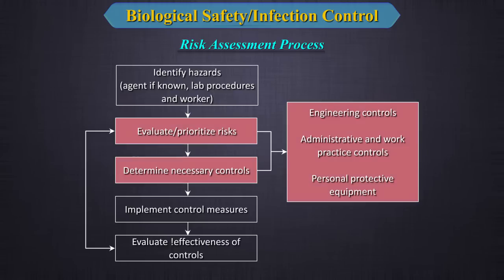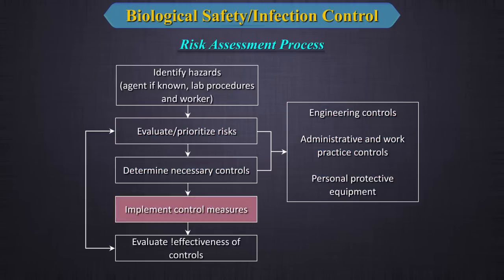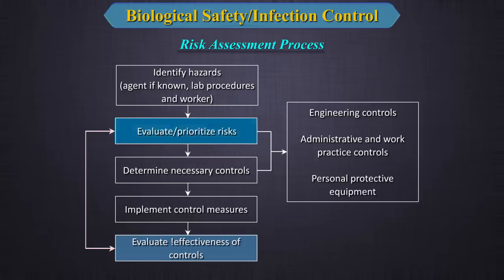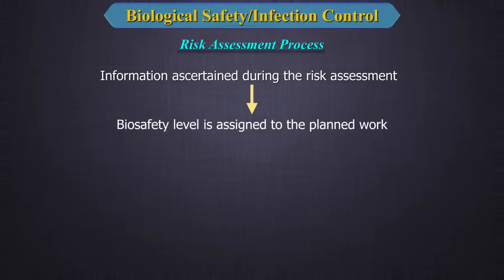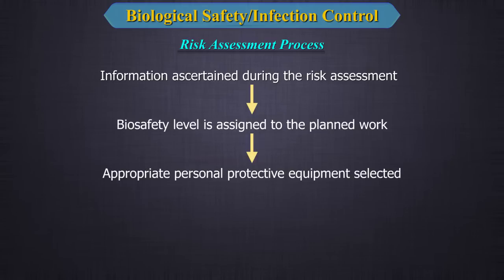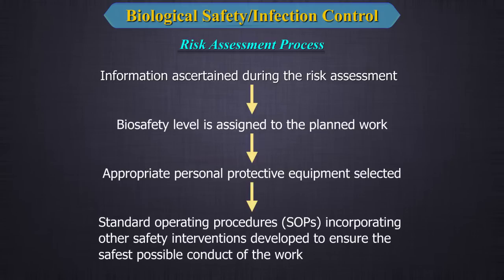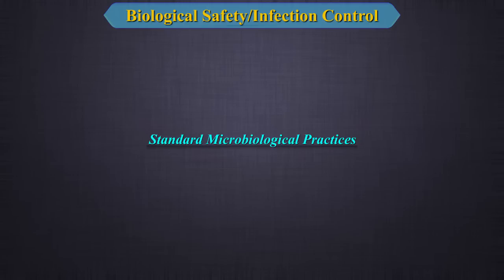Control implementation involves engineering controls, administrative and work practice controls, and personal protective equipment. Once controls are implemented, we evaluate their effectiveness, and findings feed back into the risk prioritization cycle. Based on the risk assessment, a biosafety level is assigned, appropriate PPE is selected, and standard operating procedures incorporating safety interventions are developed to ensure the safest possible conduct of work.